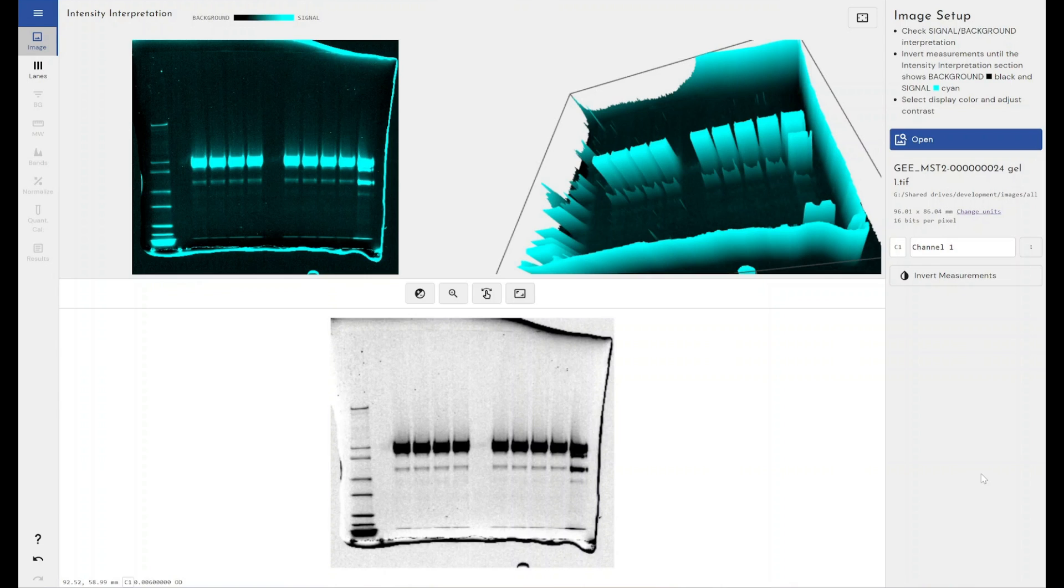Now the RF value stands for retardation factor or relative front value of our particular bands and it's useful for roughly sizing your protein, your DNA, or your RNA without the presence of a molecular weight ladder if you've not included one in your experiment.